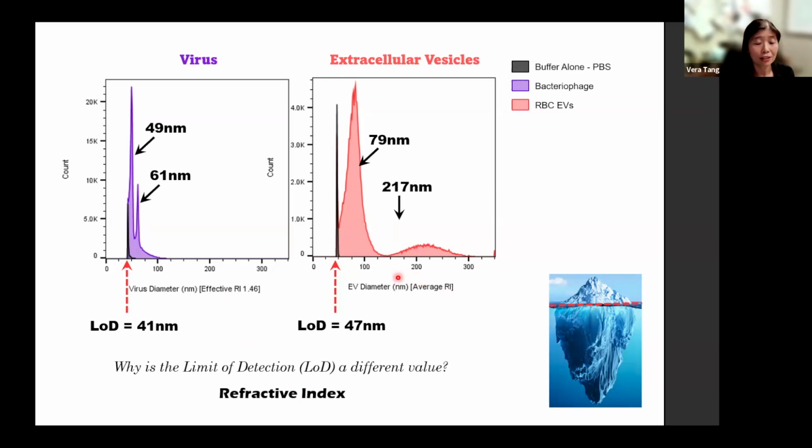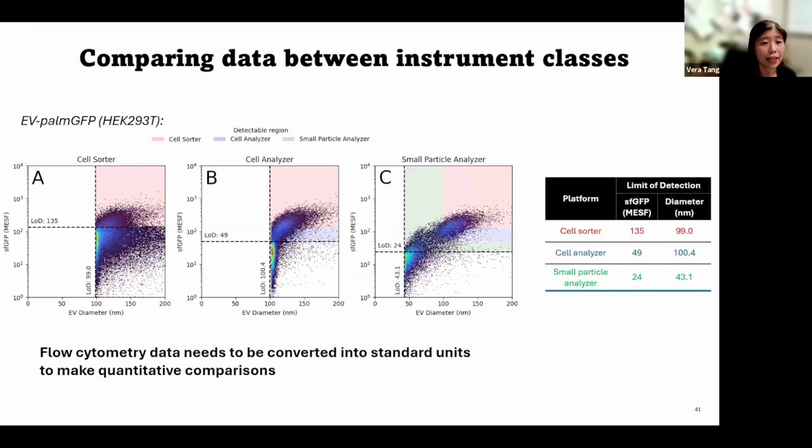So software is available to do this. We're not all Dave Novo and able to generate our own software algorithms. I certainly am not. But there is available software for you to do this. And you will then be able to actually learn more about the biology of something as well, and the different physical properties of something just by looking at calibrated data.